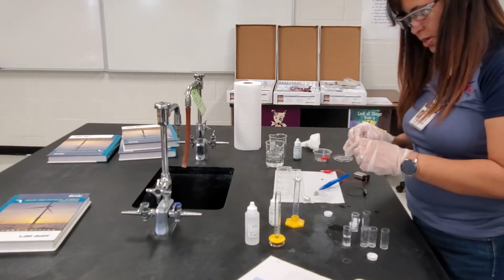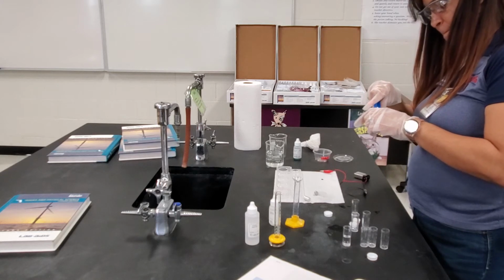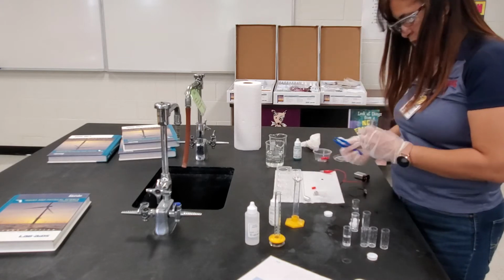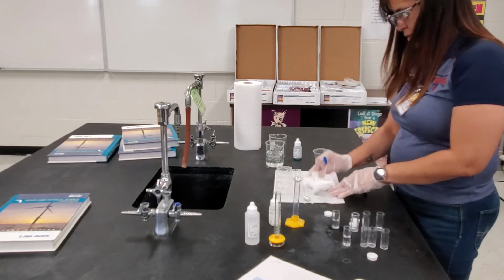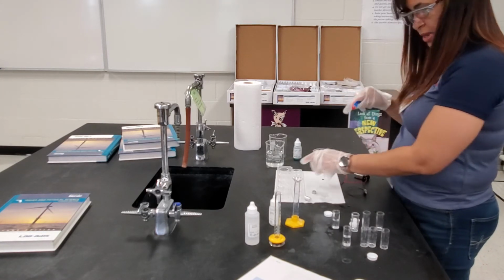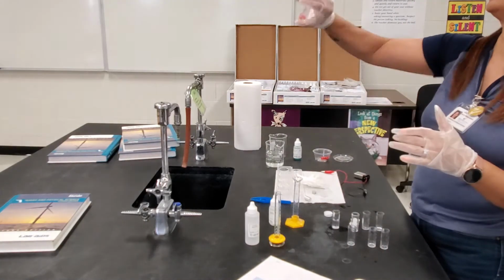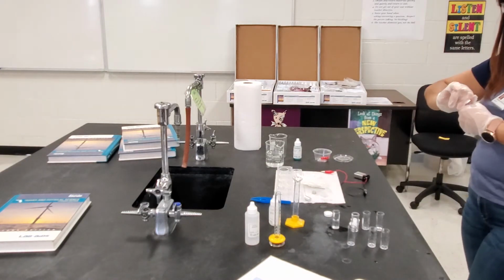I'll go ahead and pour this water in. Put our sample down. Dry it off. Then we're going to take our red tube and place it in the ethanol. Shake it up, and it sinks completely in the ethanol. So it floats in the water, but it sinks in the ethanol.